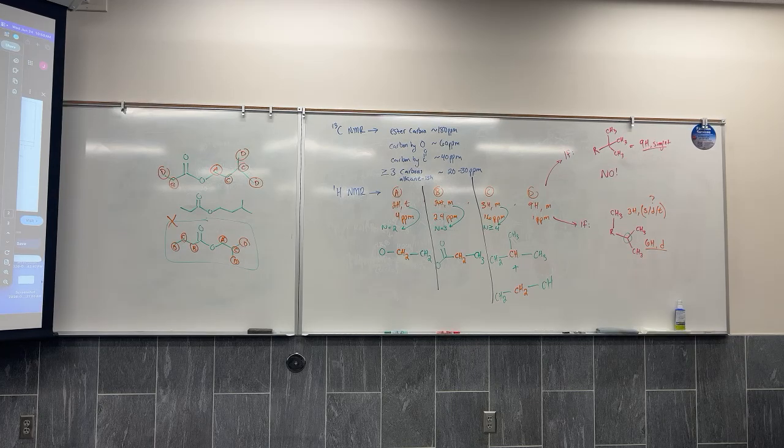How can a signal suggest that there are 5 protons that are identical to each other? There is no such thing as having 2.5 protons symmetric to 2.5 protons. So it's not like it's one signal of 5H. It's not like one carbon can have 5H. How can that result? It could result from the overlap of a 2H and a 3H signal.